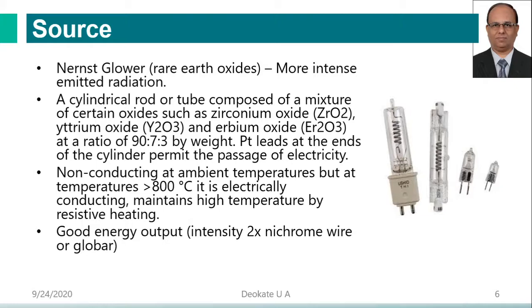They have a good energy output. Its output is double that of the nichrome wires or glow bar source. They are used in absorption instruments.